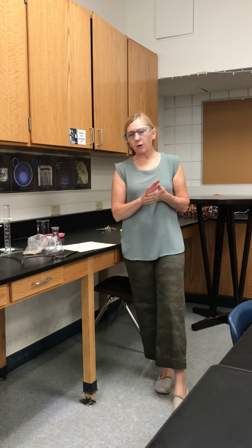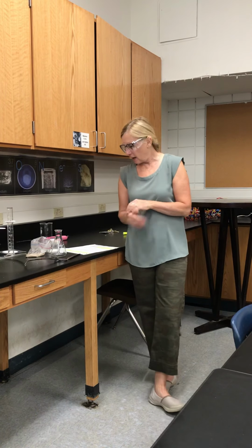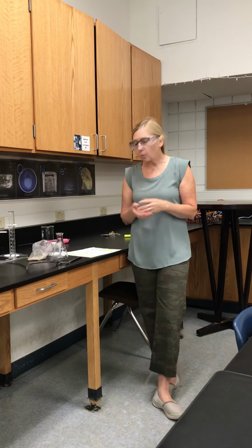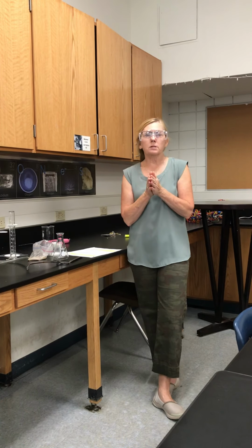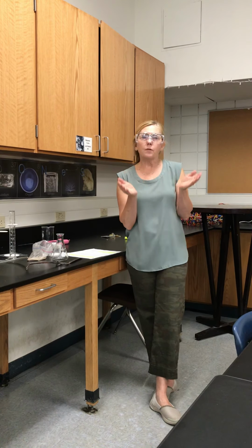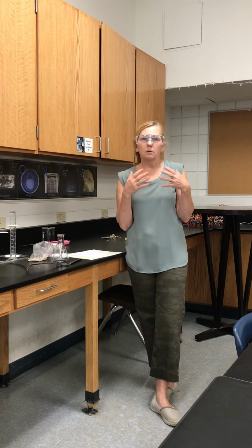Hi there and welcome. We're going to be demonstrating a chemical and physical changes lab. The purpose of this lab is to classify various mixing processes as either a chemical change or a physical change. So when two or more materials are combined, in a physical change, each of those materials retain their original composition.